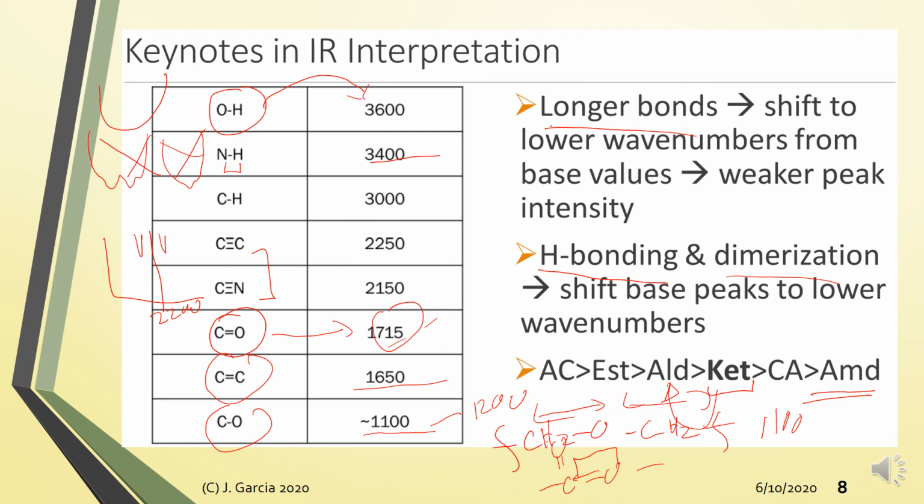But if you have OH attached to a carbonyl, as in a carboxylic acid, this particular signal will now appear at a lower wave number, no, around 3200, which usually overlaps with the C single bond H signal. Alright, so well, it's good to memorize, no, or to be at least familiar with this range of values.